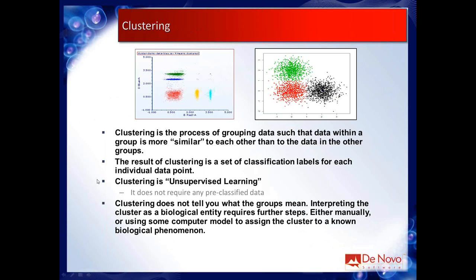It goes under the category of unsupervised learning, meaning that you don't need any pre-classified data, you don't need any prior knowledge about your data to perform clustering. Clustering is somewhat of an exploratory data analysis, like you're looking at your data, you want to see how my data naturally groups together, and then we'll find out if that's meaningful, using either a computer model, applying some extra algorithms afterwards, or you can even use your own background knowledge to determine what the clusters mean.